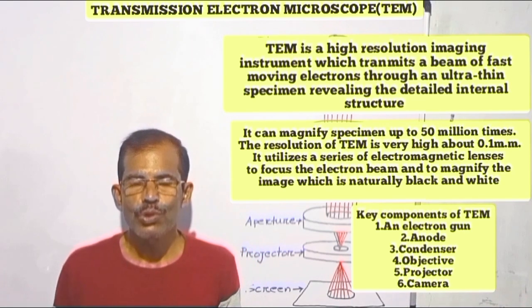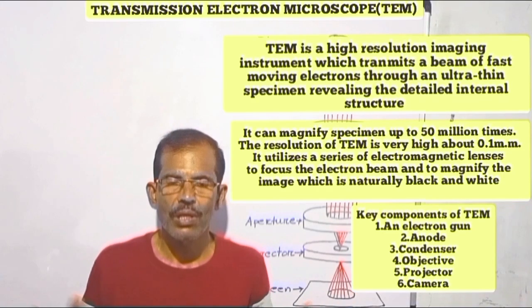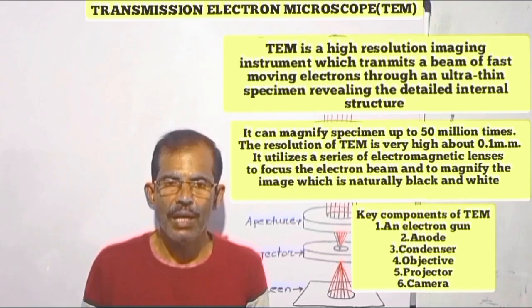The instrument which utilizes this technique is known as the transmission electron microscope, TEM.